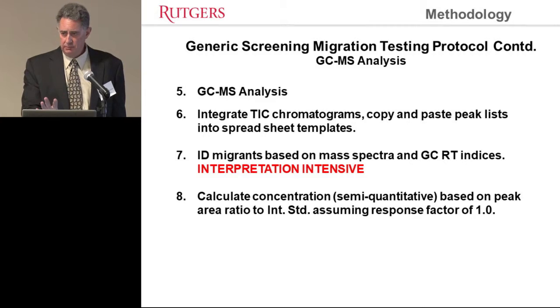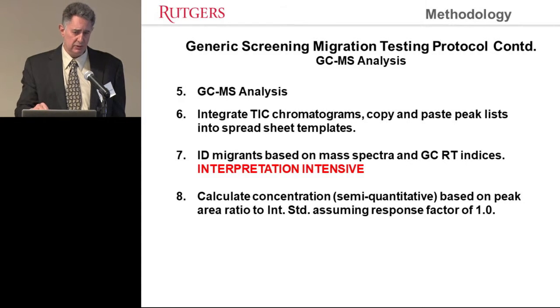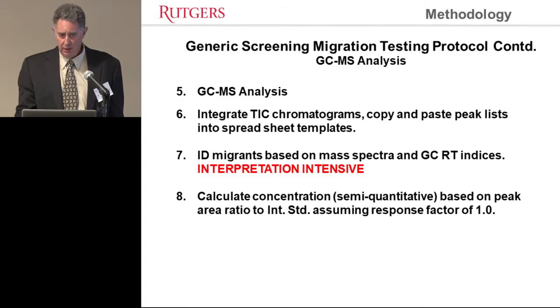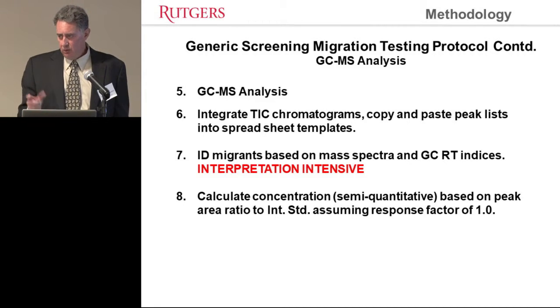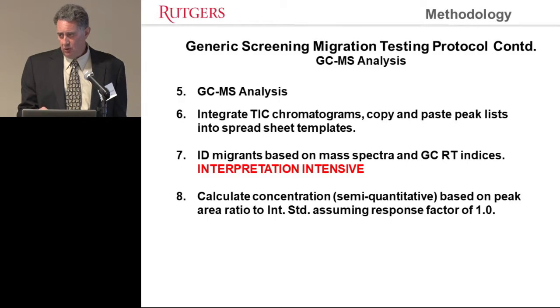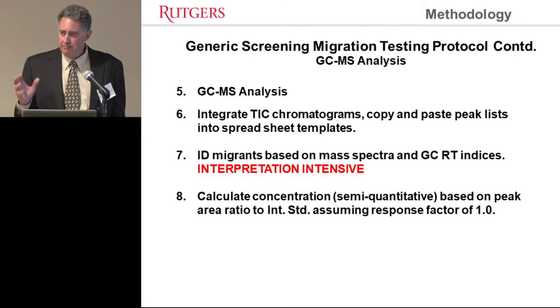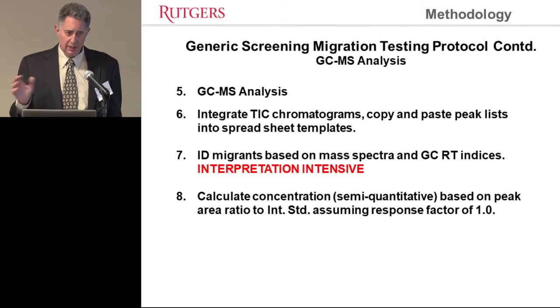This work right here, this protocol that I'm mentioning, we've been doing it for over 30 years. Multiple tens of thousands of samples have been run through this protocol. The reason I was thinking about how long I've been doing it is that we started before Windows, before Excel spreadsheets were invented. I started with a database and Quattro Pro spreadsheet, building macros and reporting templates and embedding formulas to do this. It was even before we had Windows. We were using DOS computers back then.